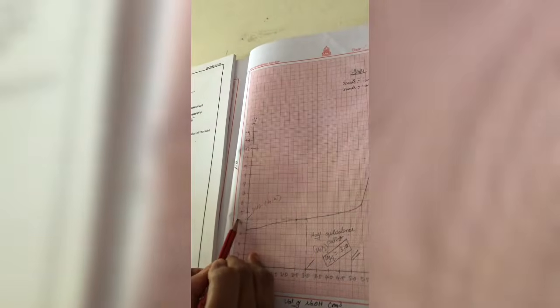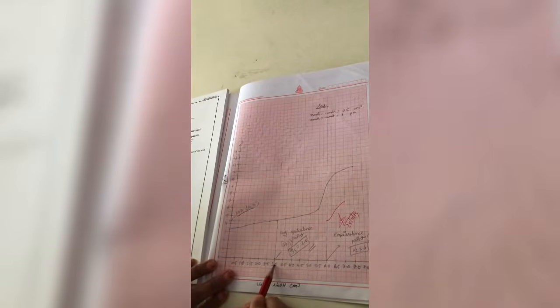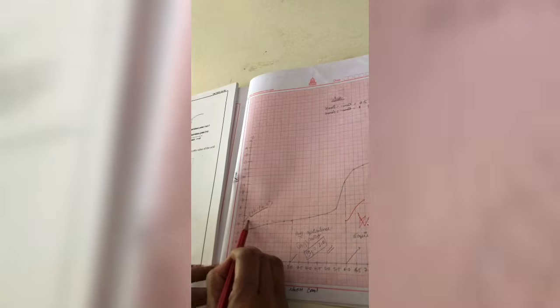Now, whatever pH we observe at the half equivalence point is the pKa value of the given weak acid. Again I am repeating, this is a very important viva question they will ask you. From these graphs there is no separate calculation part.